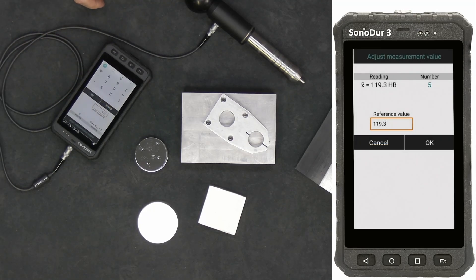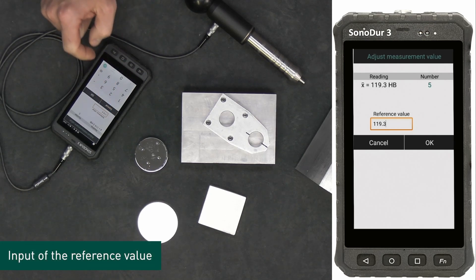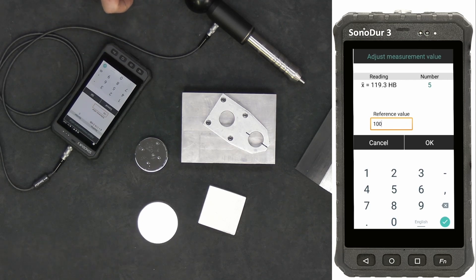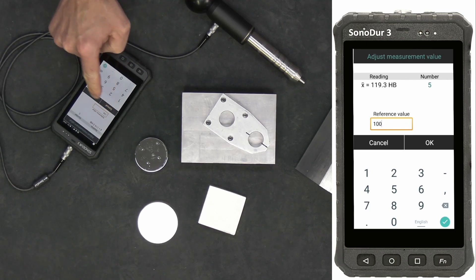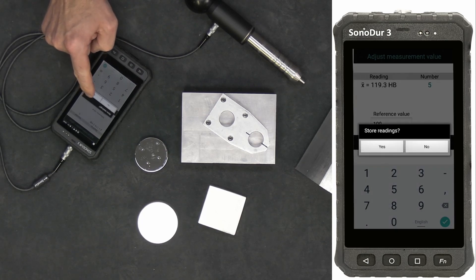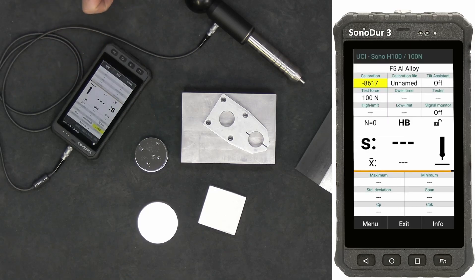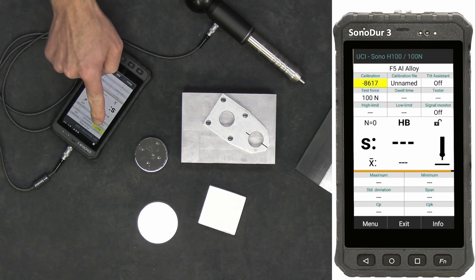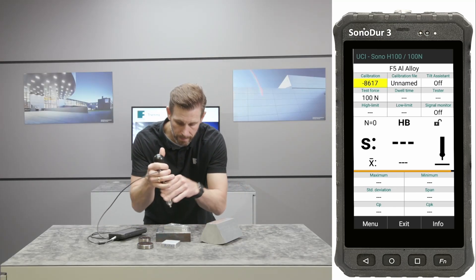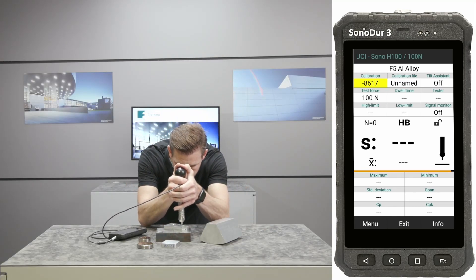Use these readings for adjustment and input the new reference value according to the desired material hardness. Whenever possible, use a reliable value from a classical hardness tester as a reference value to ensure perfect conditions. The input box of the calibration field will appear in yellow color, meaning the adjustment is active. It is now possible to perform the measurement with the corrected settings, for example for aluminum.